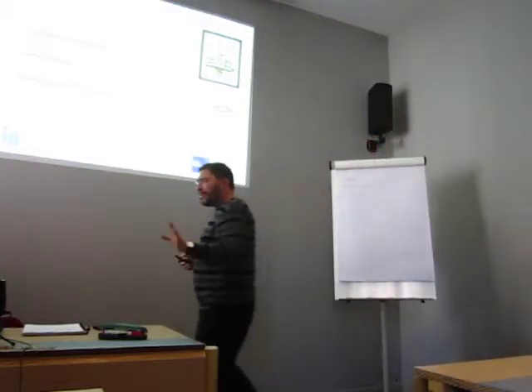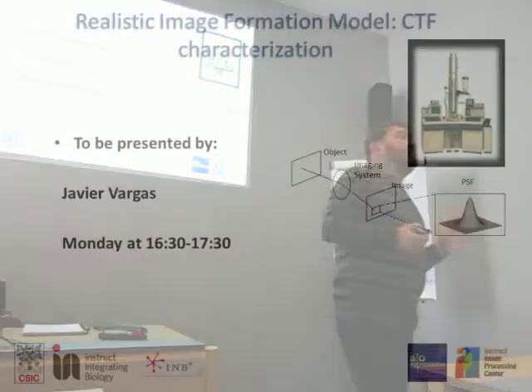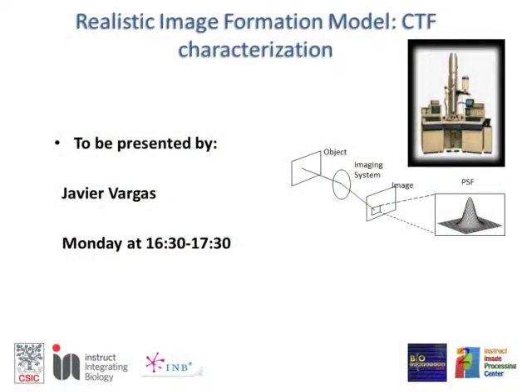But everything I'm telling you is too simplified, because you want to go to high resolution, I suppose. And if you want to go to high resolution, you need to take into account things that are not so nice. Any optical system, because we are not perfect as humans, has the following property. One point that is axiomatically infinitesimally small, when it is imaged by any optical device, has a finite extent. A small point becomes a big point because your optical system is not perfect. And the point is converted into something called the point spread function.